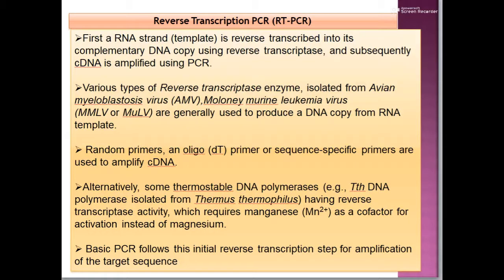Now the next one is reverse transcription PCR, called the RT-PCR. You take an RNA strand, and the RNA strand is reverse transcribed into its complementary DNA using the reverse transcriptase, and subsequently the cDNA is amplified using the PCR.